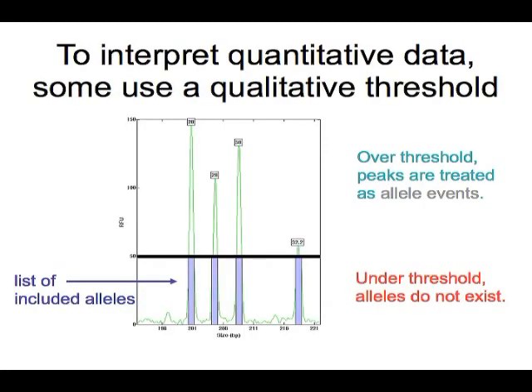Now, to interpret quantitative STR data, some groups use a qualitative threshold. And this is what they do.